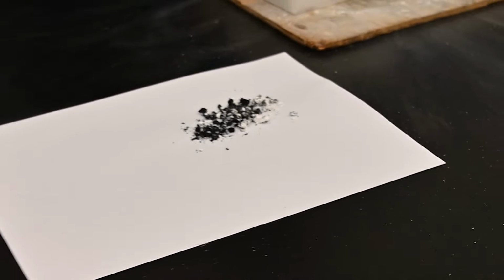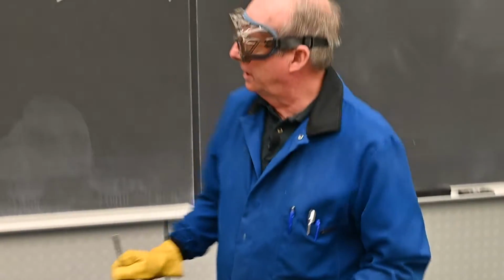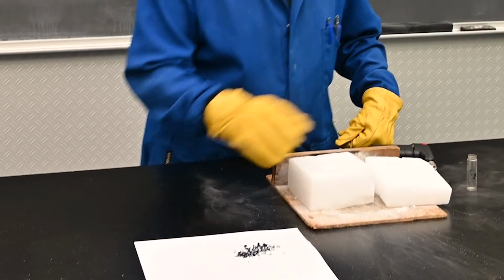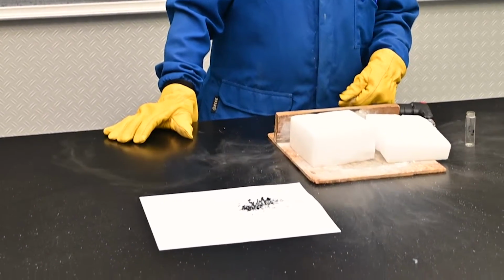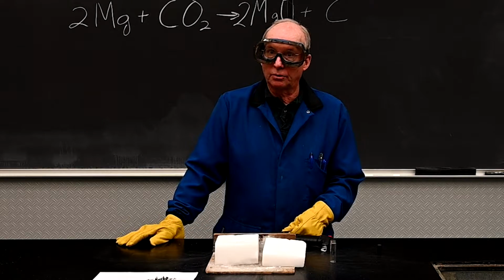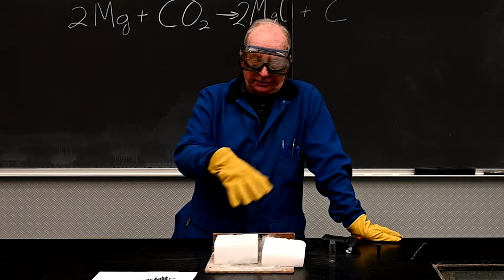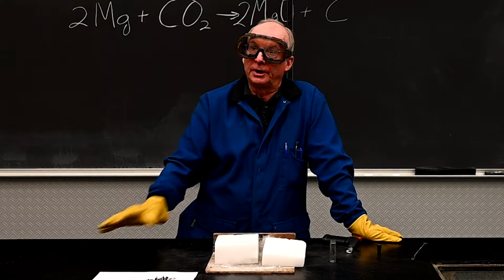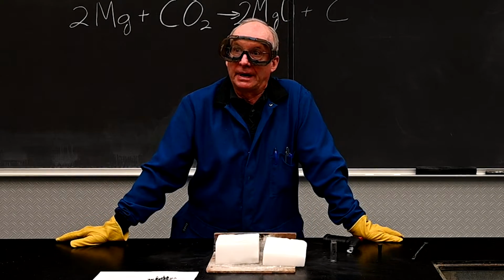A silver metal, white solid here, cold, combustion reaction. The answer to that is from our chemical reaction, it is elemental carbon. And so a very brilliant transition between the reactants and what the products are. Very straightforward chemical reaction. The magnesium is one of those components sometimes used in fireworks that gives us the bright white spark. We have scaled this up because of the size rooms we do it in, and because the bigger the chunk of dry ice, the more it's glowing, a glowing orb. You really can do it in a fairly small amount and just use a smaller amount of magnesium in there.